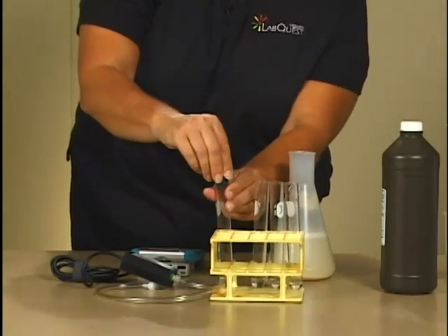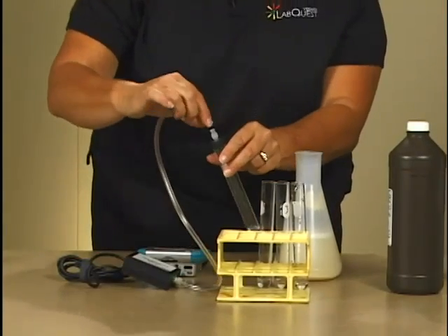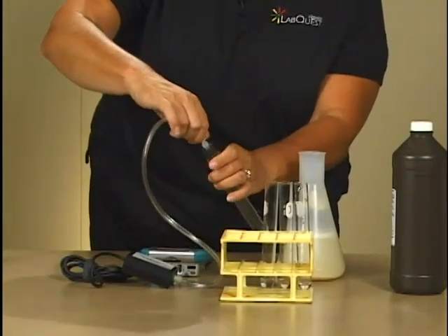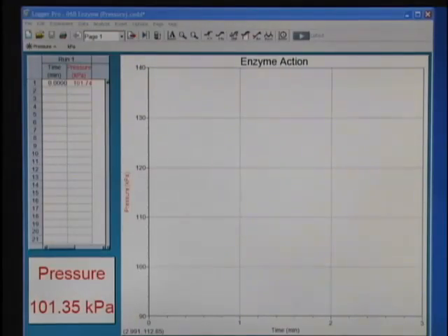Quickly stopper the test tube, swirl gently, and connect the other end of the plastic tubing to the top of the stopper and start data collection.